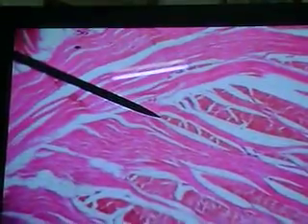Still, I need a couple more slides. I need about 5 more slides, please, of the tongue, so that we can try to find some of these papillae. So for the front, Rihanna, where is your slide box? Yes, so the guys at the top. Can you lend me a slide, a couple slides there?